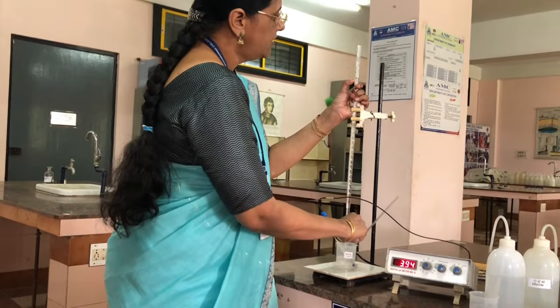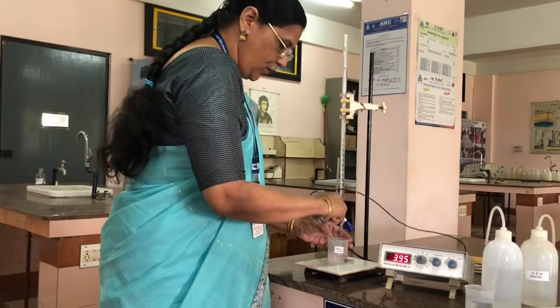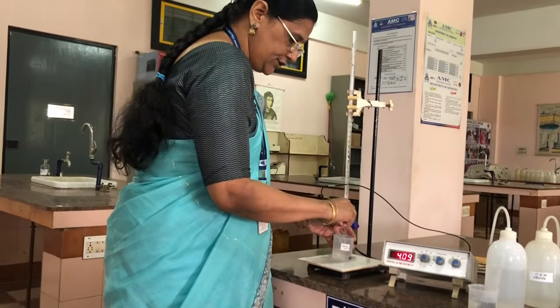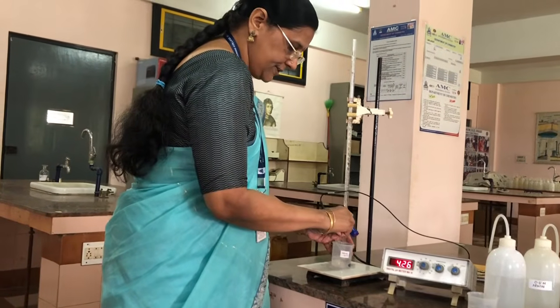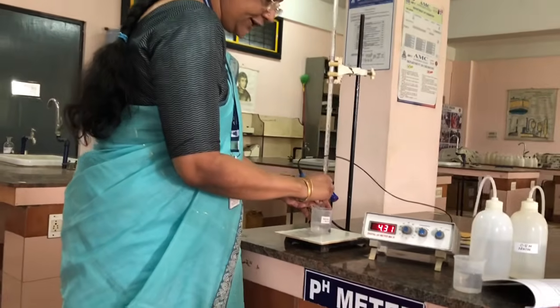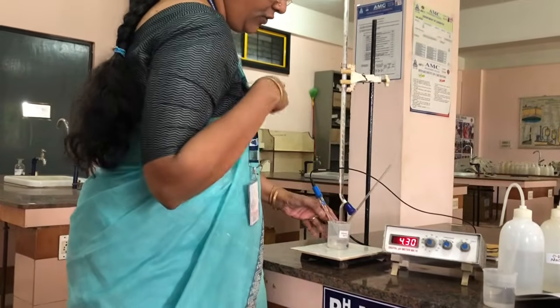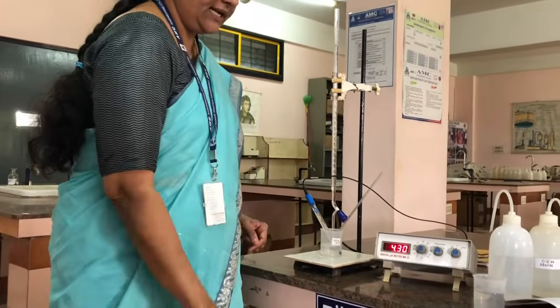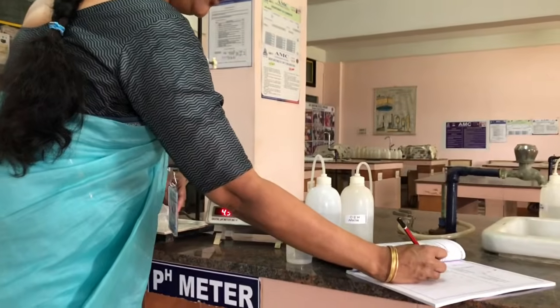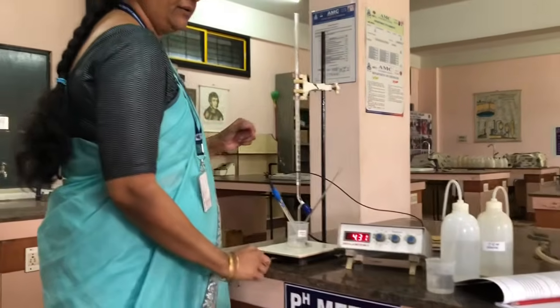After the addition of 0.5 ml, again I am shaking the solution to complete the reaction. When I shake that, again the H plus ions are getting neutralized, and the pH of the solution is increasing. Now it is showing 4.30. Again I have noted down for 1.